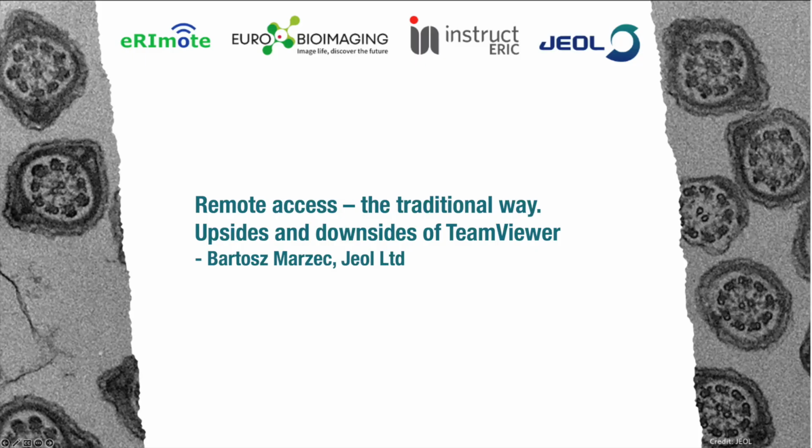Yes, indeed. Thank you, Damien. Thank you all for the kind introduction. I would like to start this webinar by discussing the currently existing technologies that allow us to control electron microscopy facilities remotely.